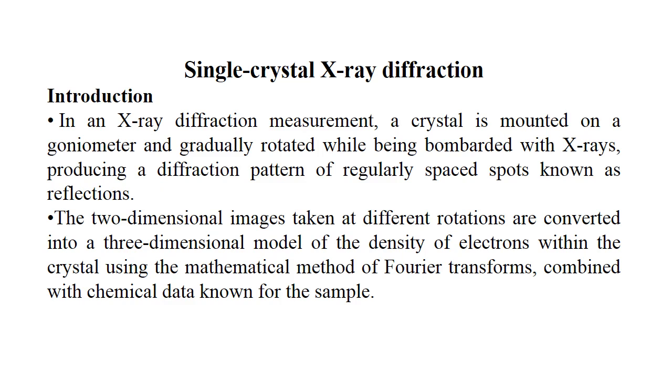Poor resolution or even errors may result if the crystals are too small or not uniform enough in their internal makeup. It means we should have a sample with crystals of enough size to be determined or studied, and most importantly, the size of the crystals should be uniform to get regular or coherent information.